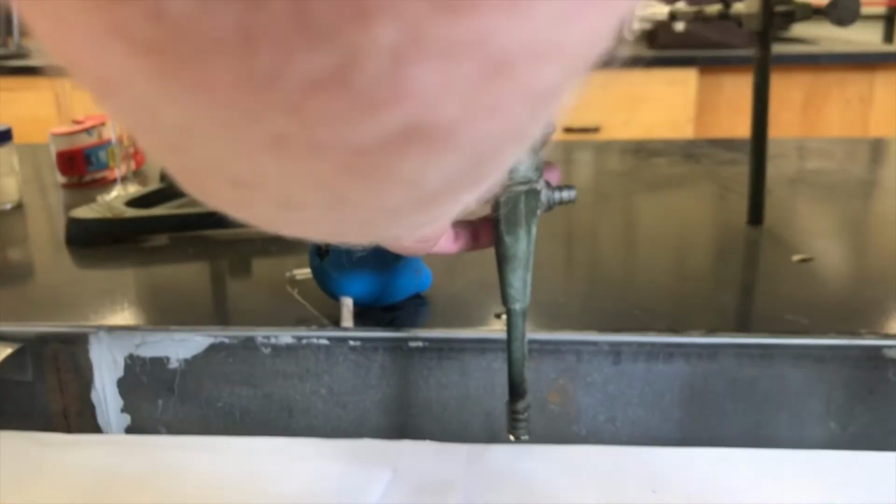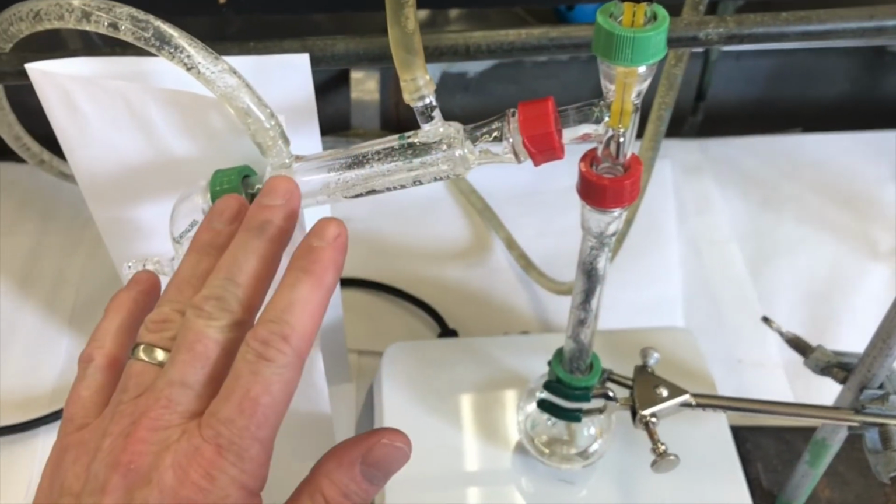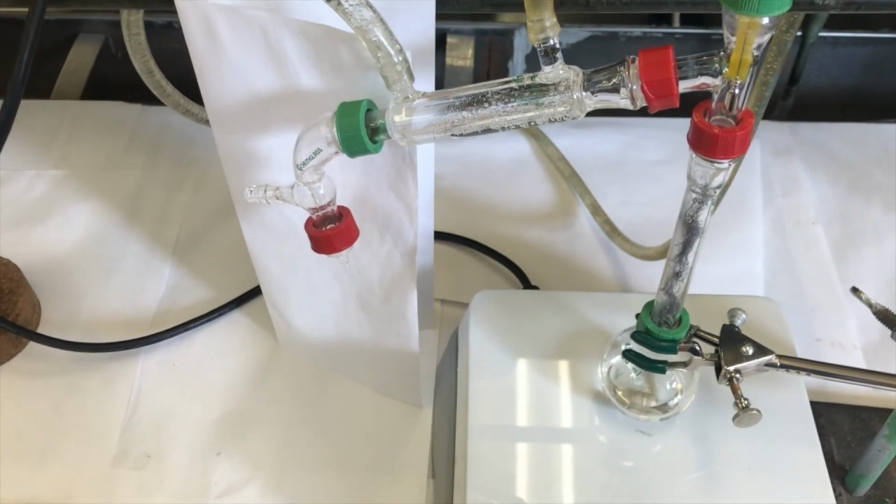It usually happens when you do this. If you're on this side of the counter and you're reaching around to untighten it from the other way, you get confused. But now we're good. We can start taking it apart. And this glassware should be very clean because it was just cleaned with distilled organic solvents. So I'll just put that back in my locker to dry.